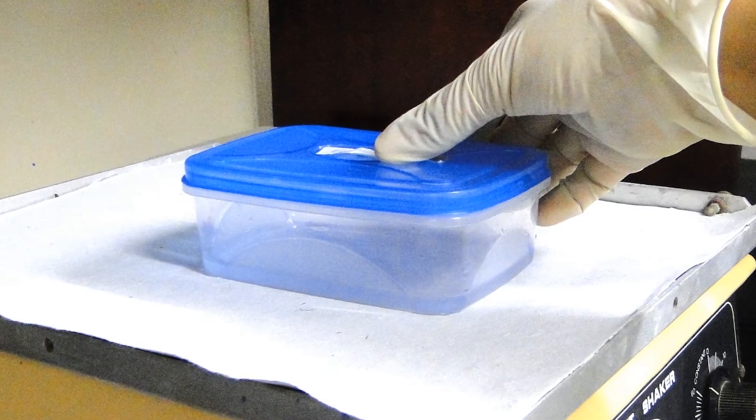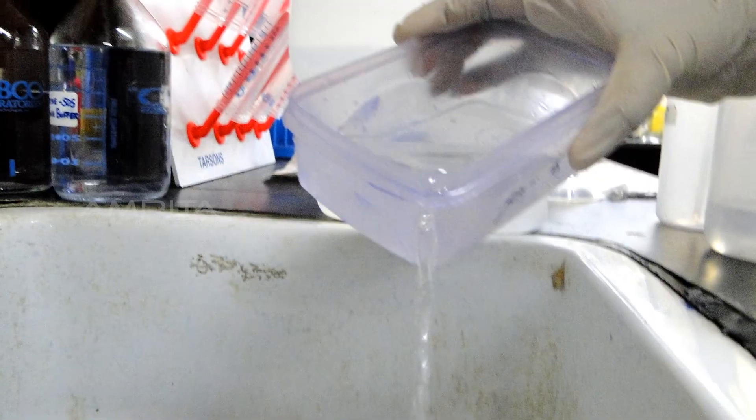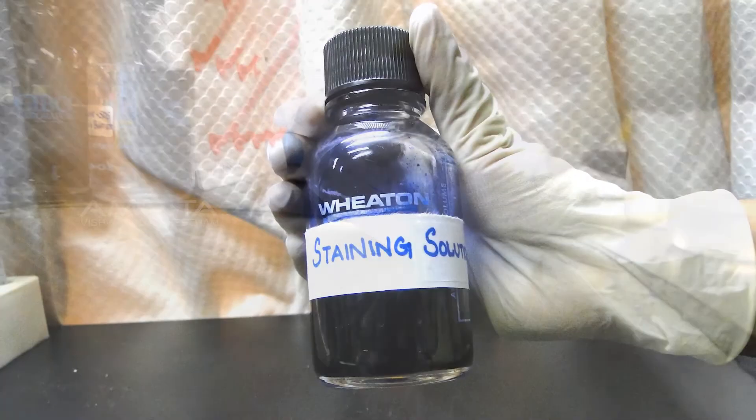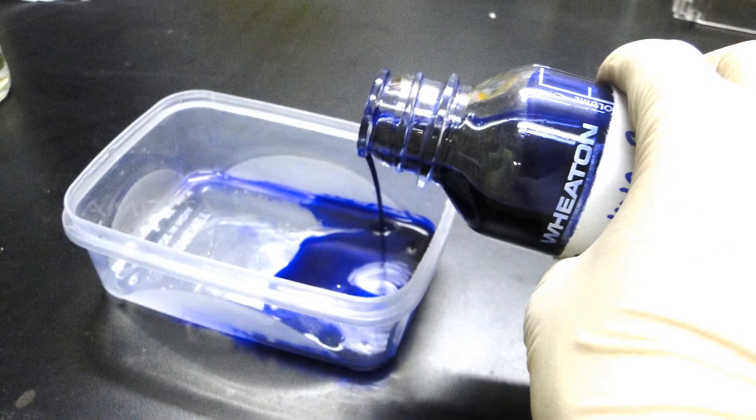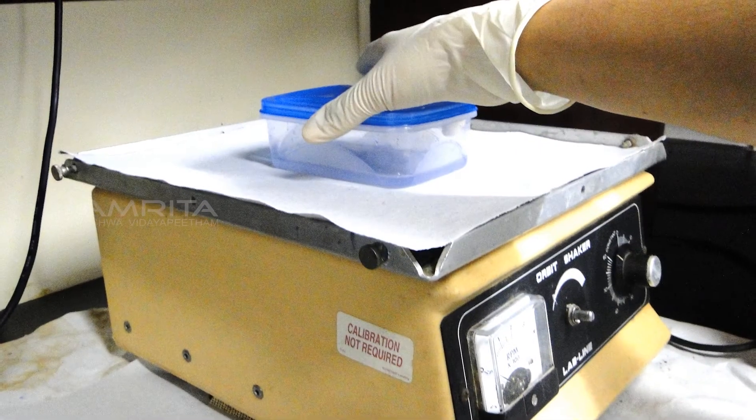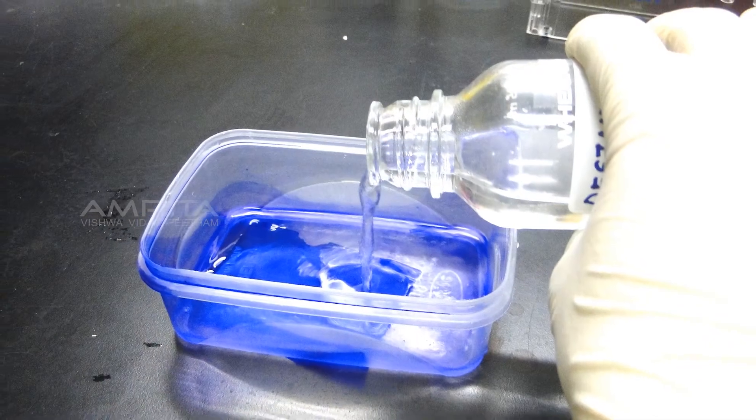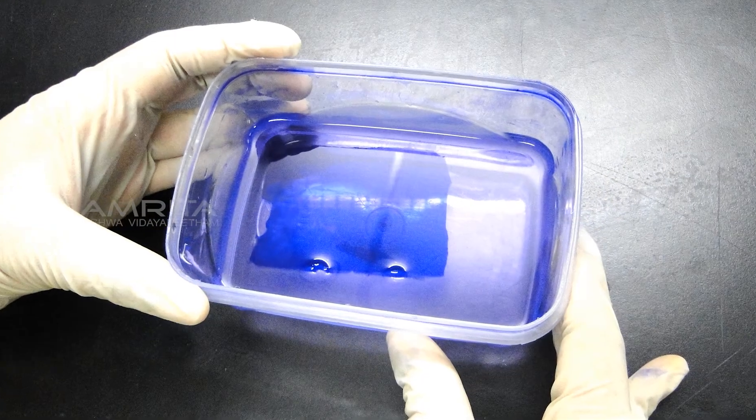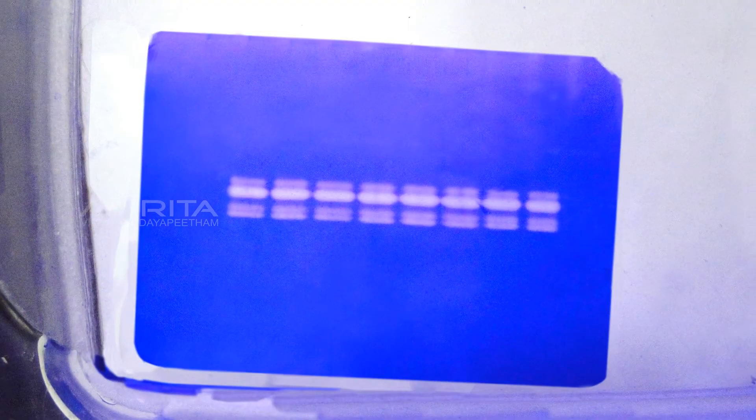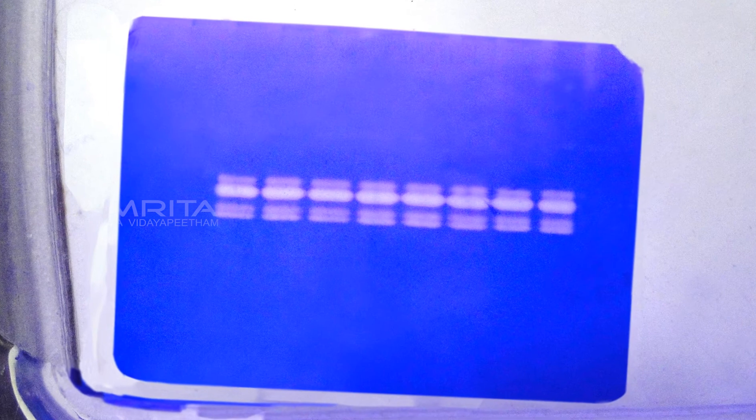After overnight incubation, discard the low salt collagenase buffer and pour staining solution into the gel. Keep it for 30 minutes incubation in orbit shaker. Destain the gel until the bands are properly seen. The presence of gelatinolytic activity of protein samples loaded will be seen as clear bands against a blue background.